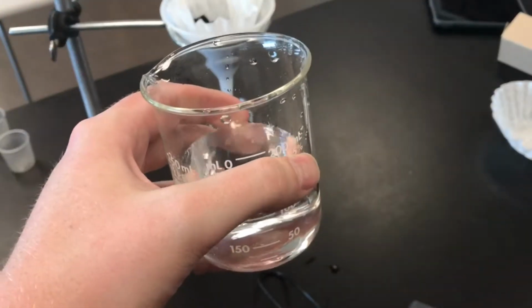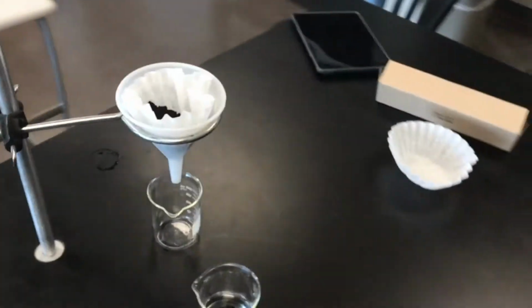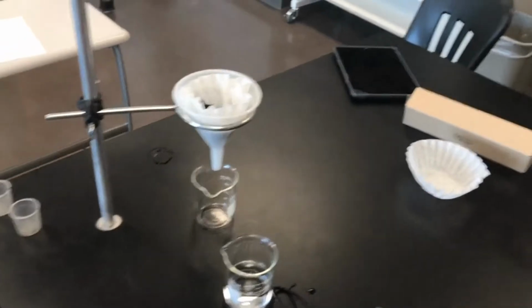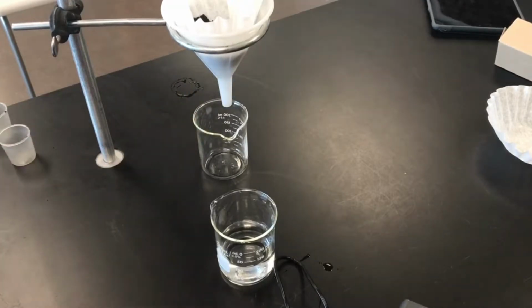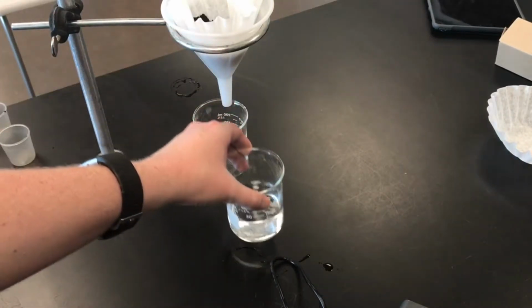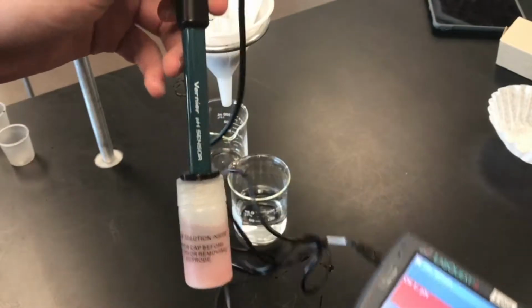Now that I've got my 100 milliliters of sulfuric acid solution, I can start running procedure 1. So again, make sure you have your soil type A in your funnel set up, that there's an empty beaker under here that's going to catch all the water discharge. What we need to do first is take an initial pH reading of the initial sulfuric acid solution. So I already hooked up my pH probe to my LabQuest device.